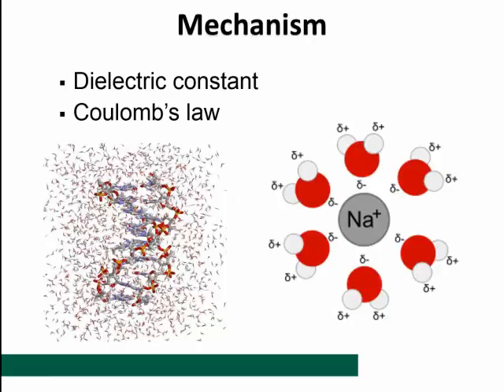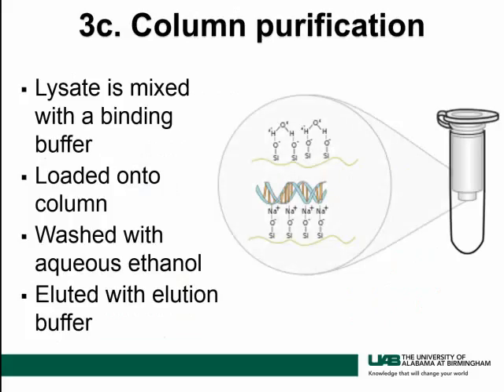And this is just what we're talking about. The dielectric constant of water is much higher than the dielectric constant of the ethanol. Okay, and so water will interact with the sodium, and DNA will remain suspended in solution. And this is according to Coulomb's law. However, when you dilute the water molecules out with ethanol, ethanol has a lower dielectric constant, which will allow the sodium to interact with the DNA, thus neutralizing the negative charges on the DNA and allowing the DNA to fall out of solution. And that is the process of DNA precipitation.